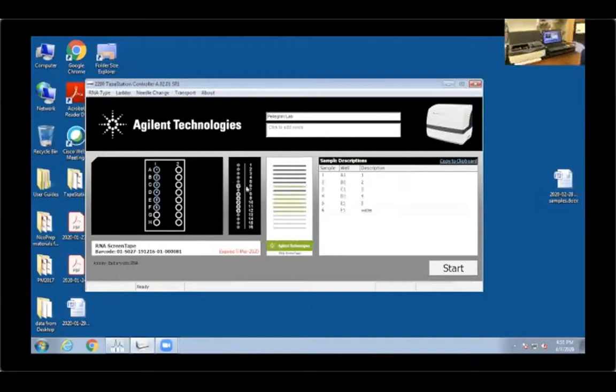And also, you might have noticed that as soon as I selected my 6 samples, 2 positions changed. So these wells 6, 8, 9 through 12 got encircled in white. These are the positions where the machine is looking for tips. In our case, I put all 16, so I don't have to worry about specific positions. But if I were to run low on tips, I would have to precisely put the tip in those specific positions.